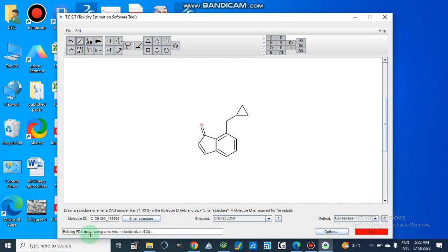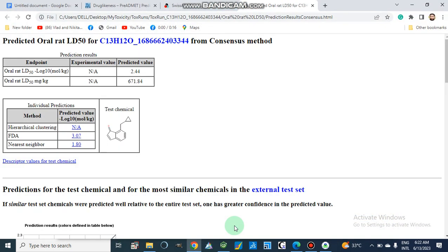Now it is taking data from the FDA model. After completion, the results are open. For oral rat LD50 in minus log10 (mol/kg), the experimental value is not applicable and the predicted value is 2.44. For oral rat LD50 in milligrams per kilogram, the predicted value is 671.84 mg/kg. This is the LD50 for this compound.